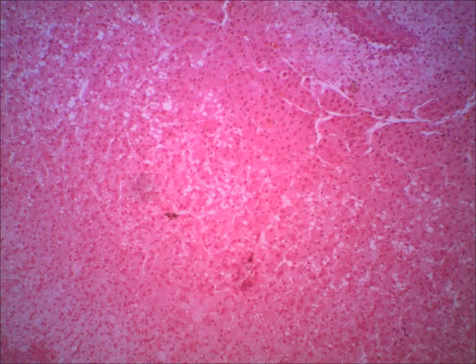If we look at this on a higher view, all right, look at the bottom left corner. Do you see how in this area the cells tend to be somewhat lined up? Okay, look for that here. Oh, you can see it really well right there. See how they're lined up? I realize you have to look for this. It's not something that's just going to pop out at you. But we would be in the cortex here. And then in this area at the top right of the slide, that would be the medulla.